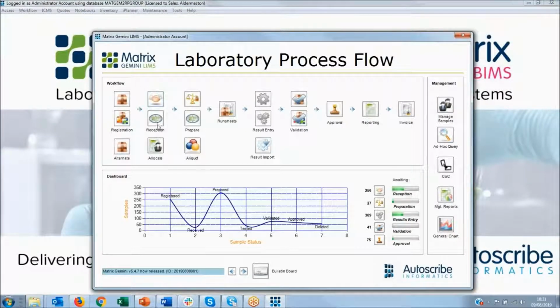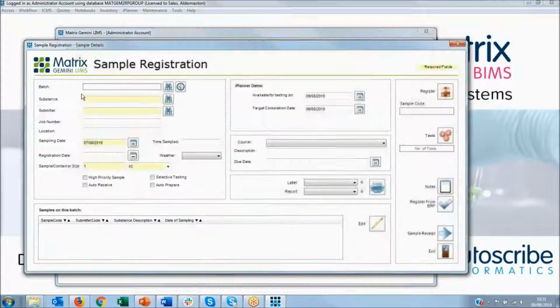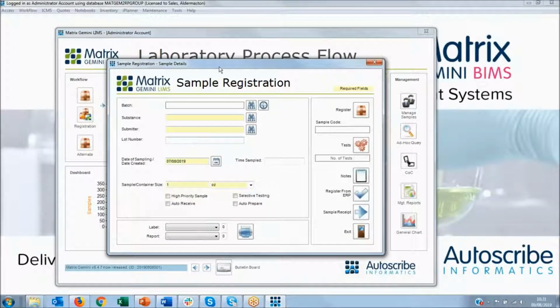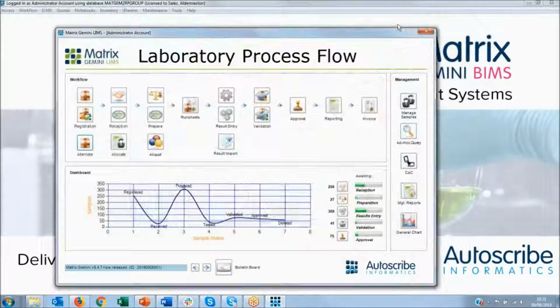There we go. So this is now the top level screen, and we've created this new version. So this is our usual sample registration screen. You can see we've got our changes on here we've done previously, and this is the alternate registration screen, and this is a default registration screen which you can then change to suit your needs. If the registration screens don't exist, it creates them automatically and you carry on with any further changes you want. So that's auto generation of screens.